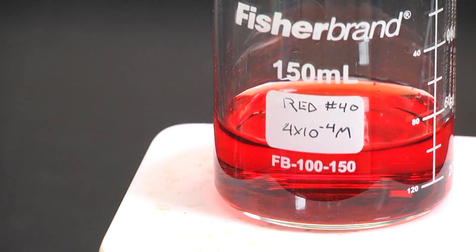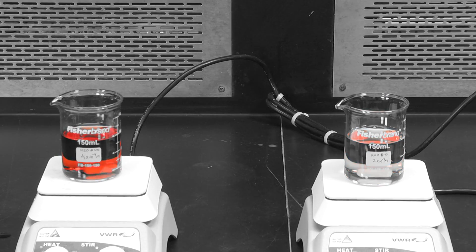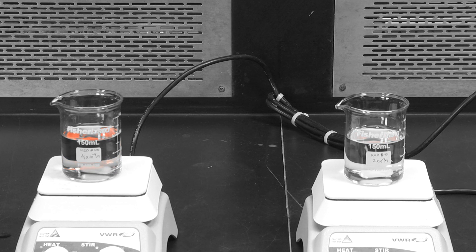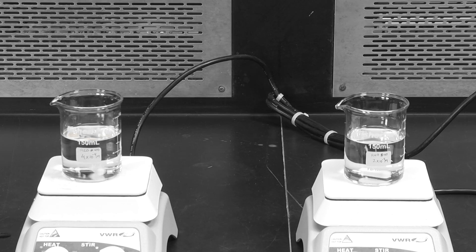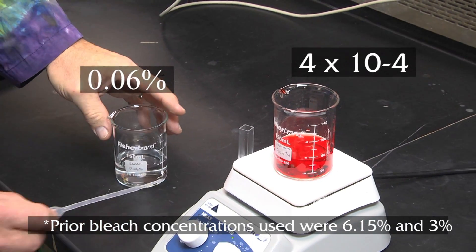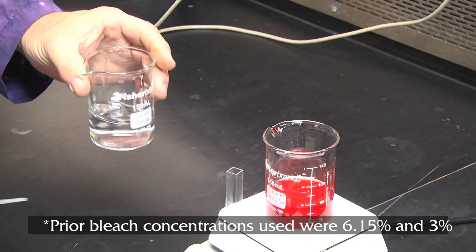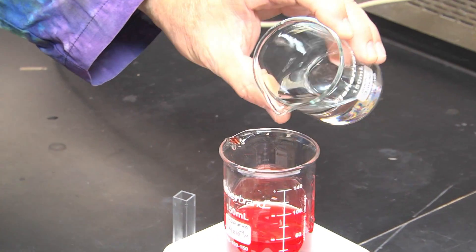But the reactions just shown are too fast. The reaction will be over before we can get the reaction mixture into the spectrometer. We will have to slow the reaction down quite a bit to make good measurements. This is best accomplished by lowering the bleach concentration. Let's see how this can be done.